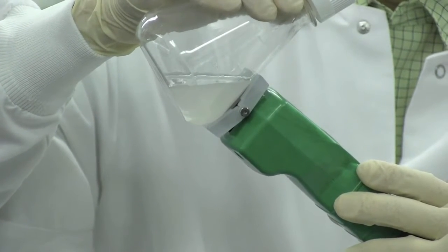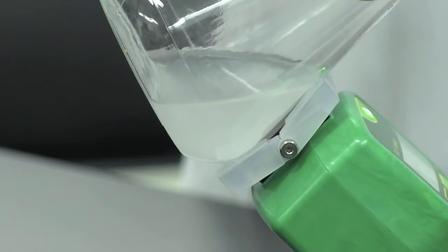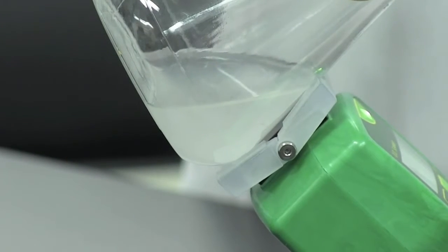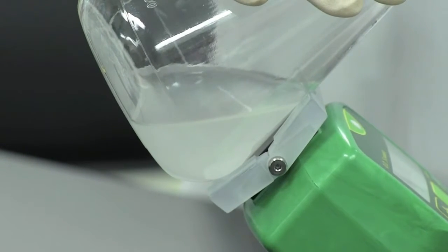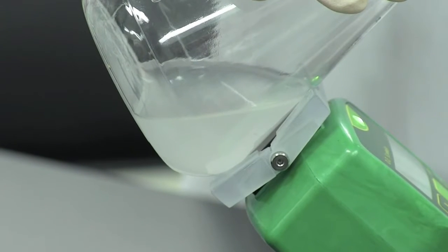sensor face. Press the instrument against the side of the flask until both position sensors are engaged. You may be able to hear or feel the position sensors click as they are pushed back and become flush with the measurement window. Depressing the two position sensors simultaneously will automatically initiate a new measurement. Continue holding the scanner against the flask without movement. You will hear one or more short tones, each followed by a pause, and finally a more rapid series of 3 harmonic tones.